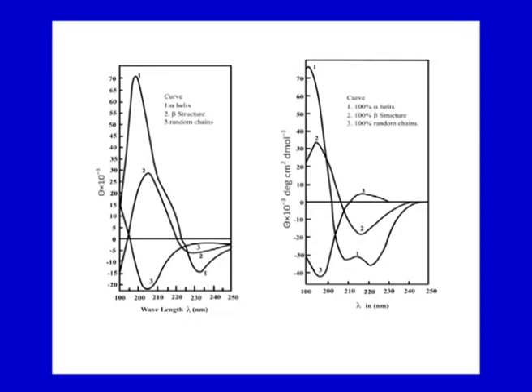So, if you consider ORD and CD spectra here, then as you see in these diagrams, there are clearly much clearer bands in CD spectra. This is for alpha helix, and this is for beta sheet, and this is for random coil structure. If you see, for alpha helix there are 2 peaks here, but they do not seem to be there in ORD.